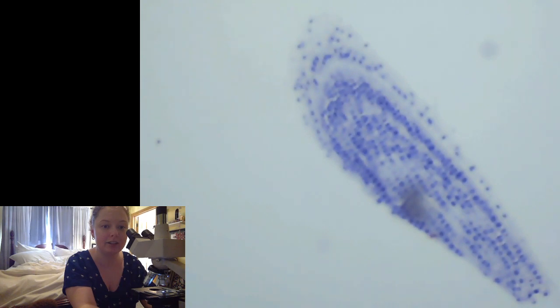Okay, yeah, so part of this was I wanted to show kind of how microscopes work. So when you're using a microscope, you always start with the stage all the way down and nothing is focused, and you start on the lowest possible magnification, and then you bring it up into as focused as you can get. And this is a little bit hard because what you guys see in the camera is not as good as what I see.